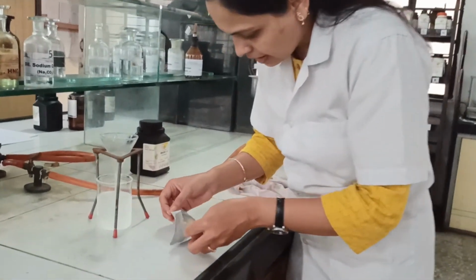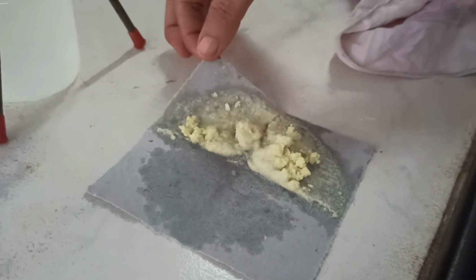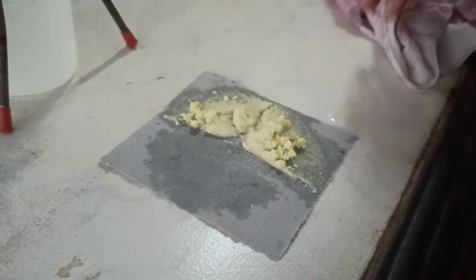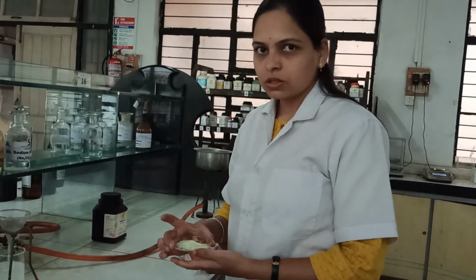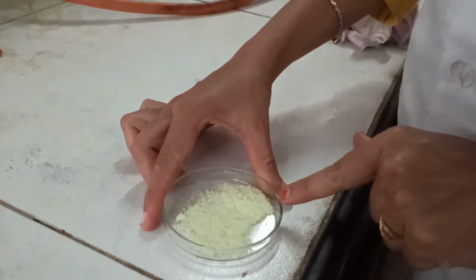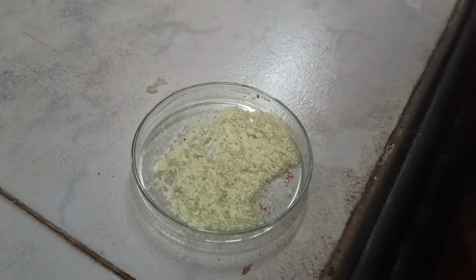Observe this as our crude benzil. Now we will proceed for the drying of this product, and then we will report the yield of this product, and also we will see the calculation of the practical. Students, you can observe the crude product of benzil after drying. Now we will proceed to the calculation part.